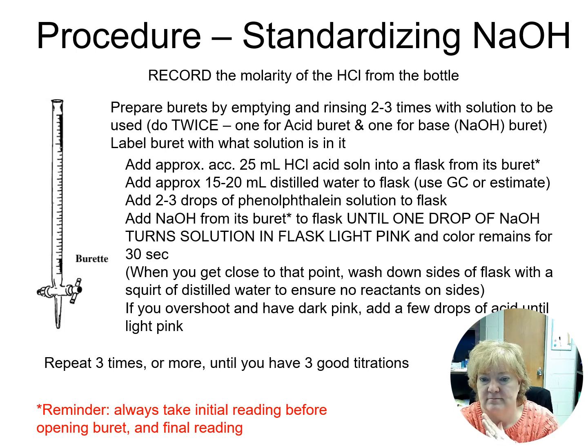Again, don't forget, every time we use a burette, we take 2 readings of it, and they should always be to 2 decimal places.